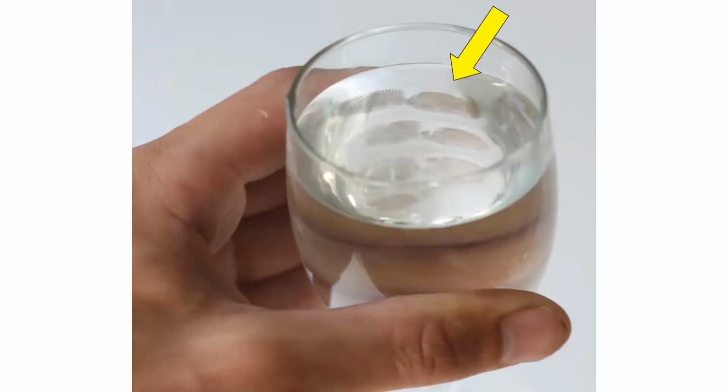You can actually observe a non-fluorescence version of this effect the next time you hold a cold glass of water with a bit of moisture on the outside with your hands. Looking through the water, you'll very clearly be able to see the skin patterns, lines, and curves that make up your fingerprints.